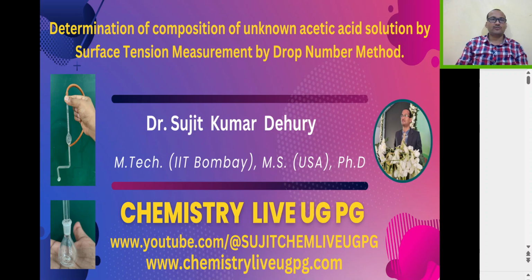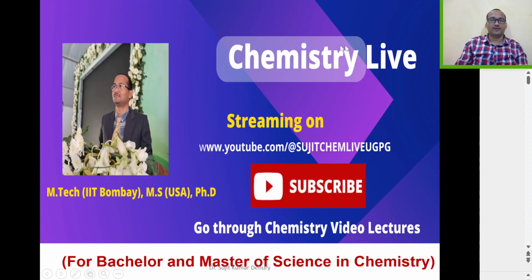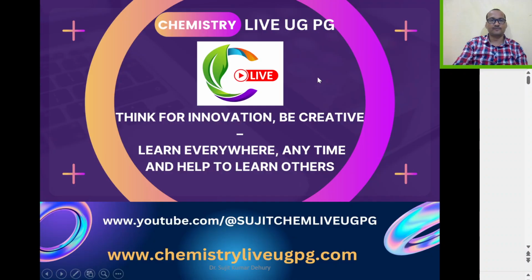So today we are going to talk about determination of composition of unknown acetic acid solution by surface tension measurement by drop number method. So this will be highly beneficial for BSc and MSc chemistry students.